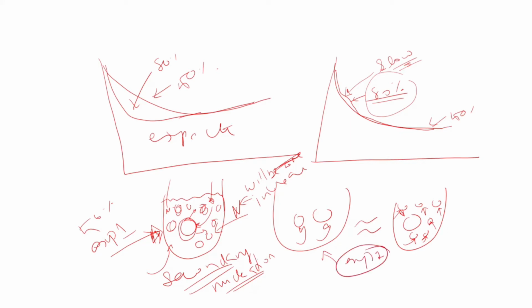So this is the whole idea, and that's why crystallization is a very difficult process. Even a tiny bit of impurity, maybe a dirt particle inside the crystallizer, can create this type of unwanted events. Anyway, maybe we may be lucky.